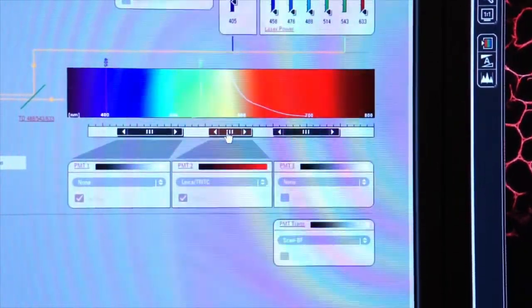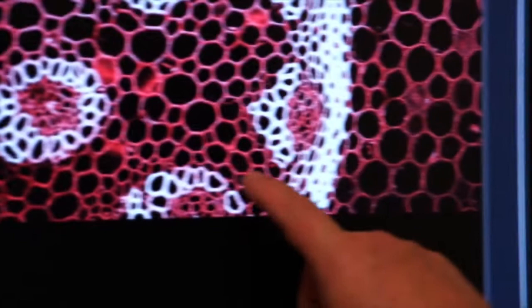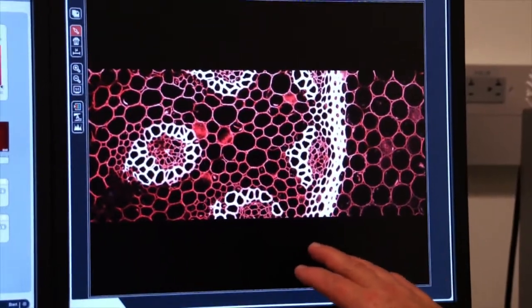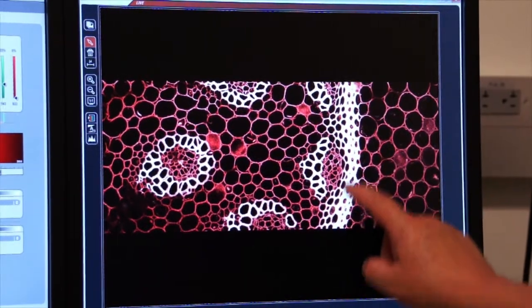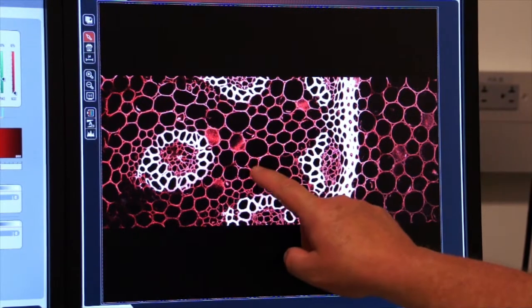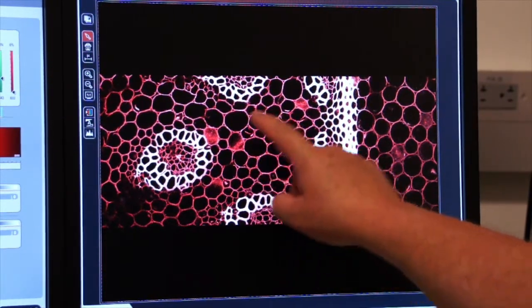If we concentrate on the composite image on the right-hand side, you see a beautiful representation of the light being emitted as a result of the excitation by the 405 line and the light being collected as a result of the TRITC line.